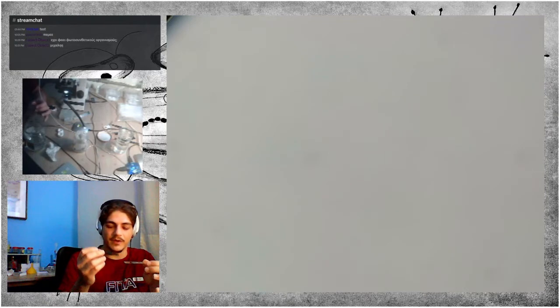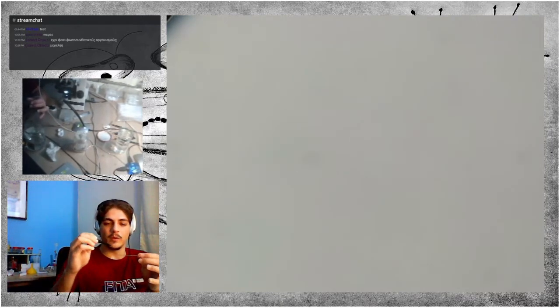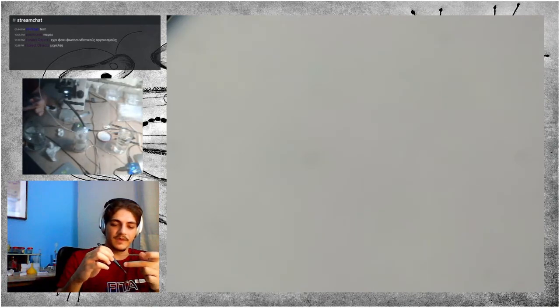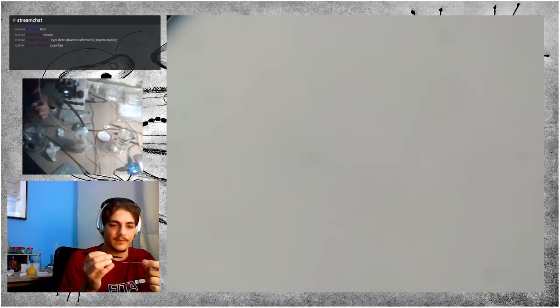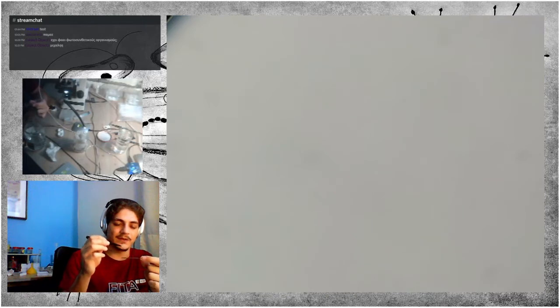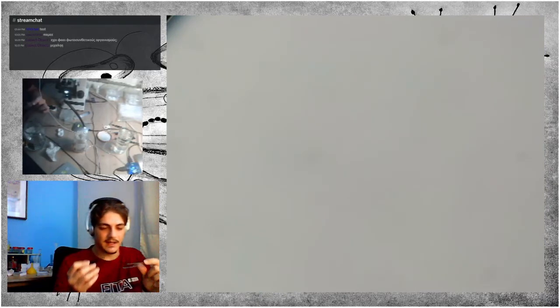This causes the water, which wants to have the minimum surface area, to latch on and stay on the closed tweezers, and when you open the tweezers, the water loses some of the surface area that it has been on, and it causes it to drip and go right into the slide. Now the slide is quite full of water.